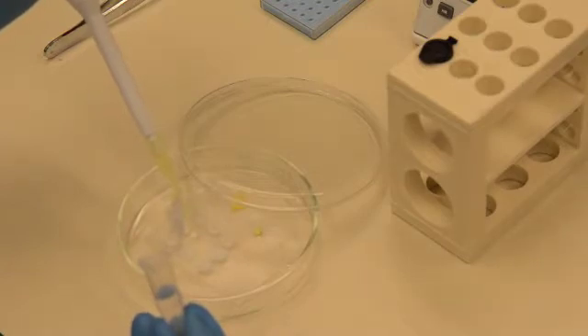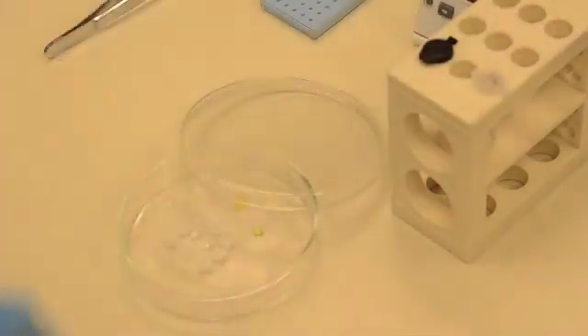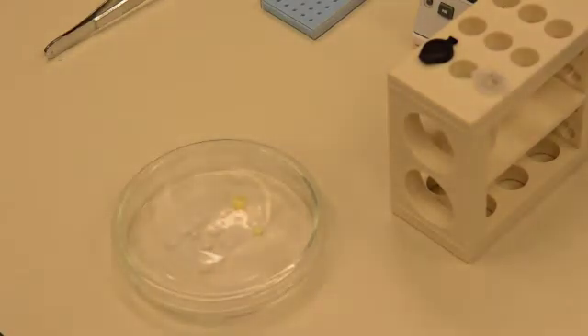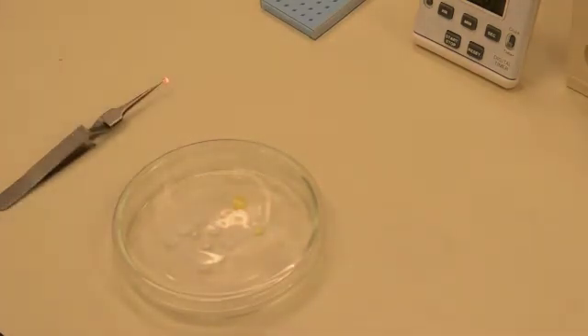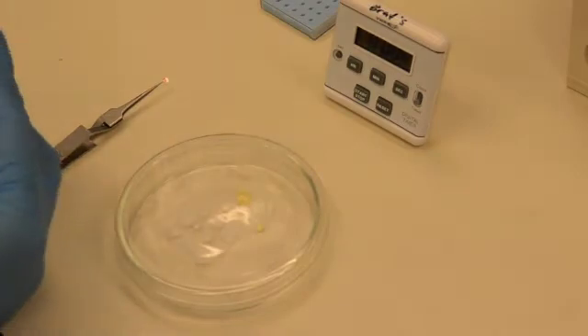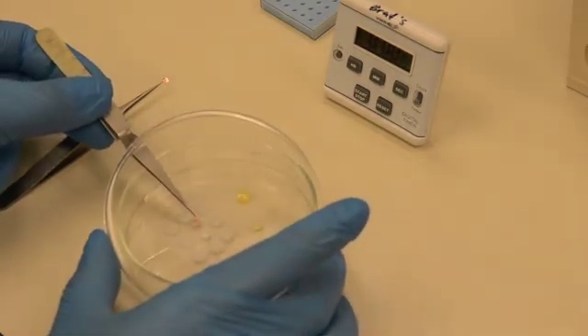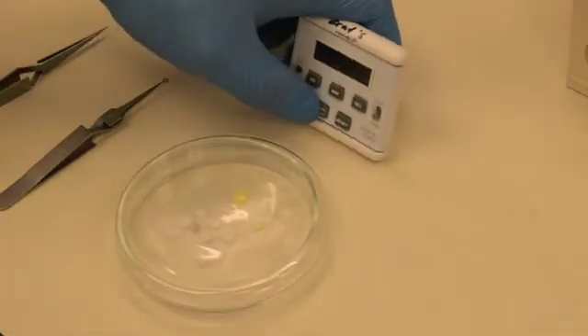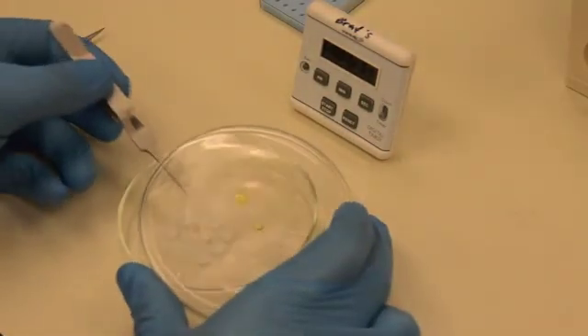Add one droplet per sample. Get yourself ready to place the grids onto the lead citrate by removing any clutter or objects. Lift the petri dish just enough to place the first grid onto the first droplet, sample side on the stain. Start the timer and wait one minute to place the second grid, ensuring it is also sample side down on the stain.